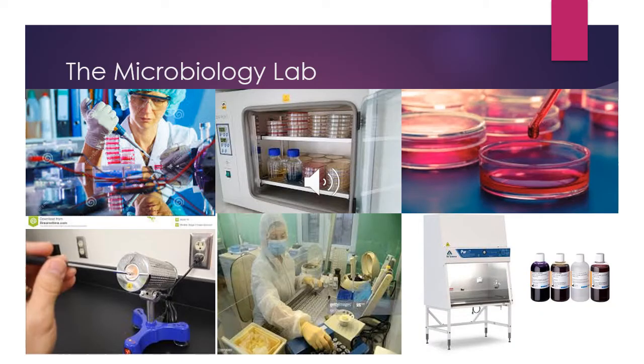The microlaboratory is a very dynamic yet very challenging area of the laboratory. This is where most of your clinical specimen undergo processing to be able to identify microorganisms found in clinical specimen. You may see inside the laboratory a lot of equipments like your oven, your biosafety cabinets, your loop sterilizers, your staining materials. So you see, it's a very busy and dynamic area.